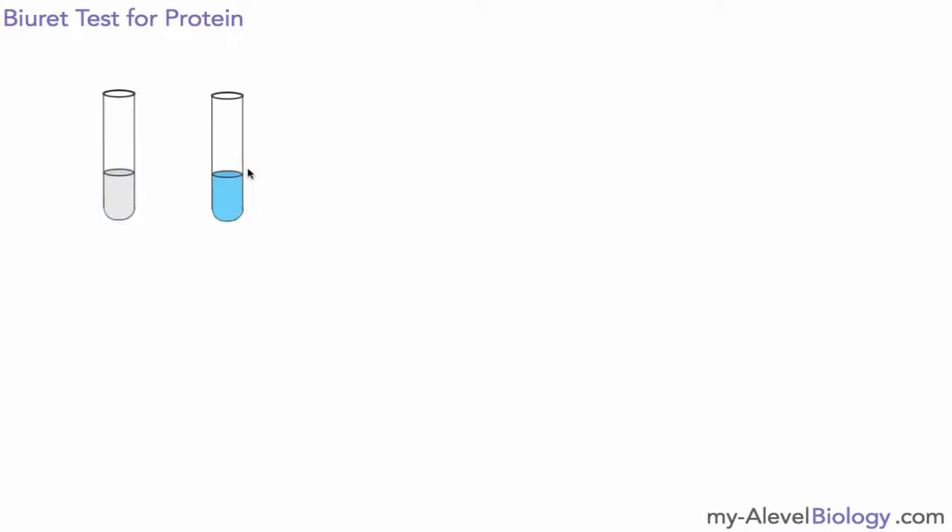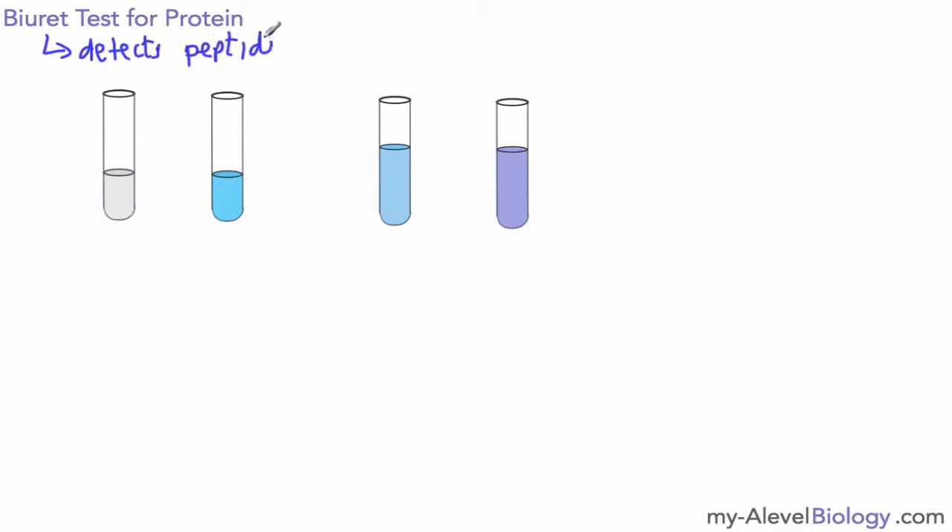I will then collect some biuret solution, or biuret reagent as it's often called, and add an equal volume. Once I've done that, I have the two together, and after a moment or two it should turn into a mauve or lilac colour if there is protein present. Biuret solution actually detects peptide bonds, and if you've watched the video on proteins then you'll know all about those.